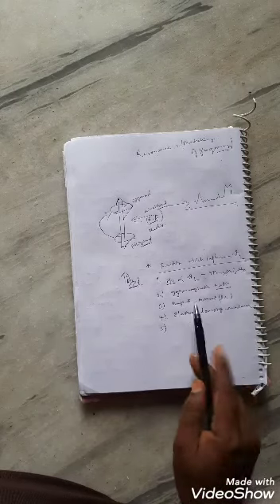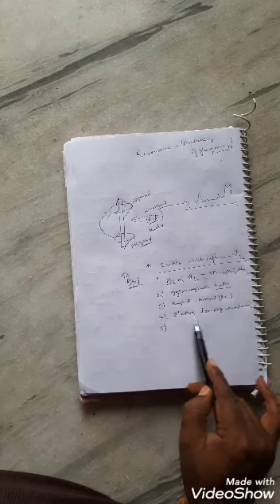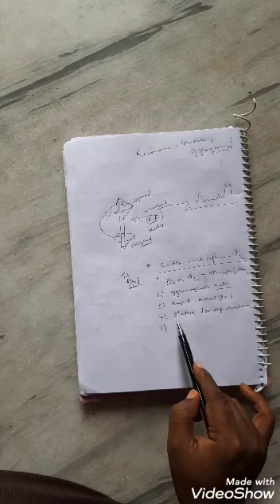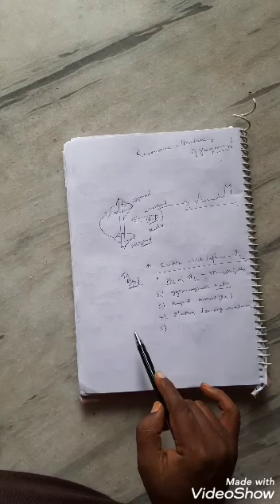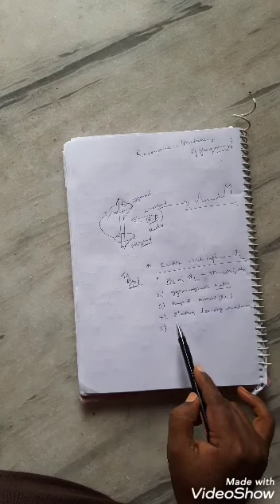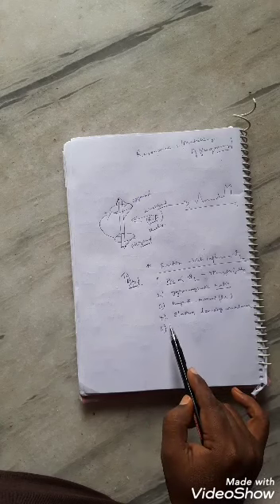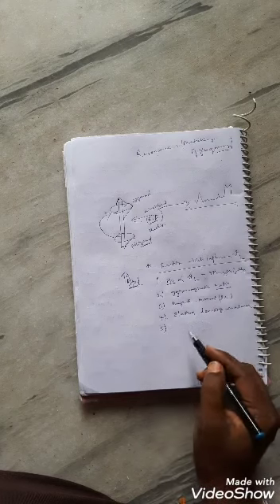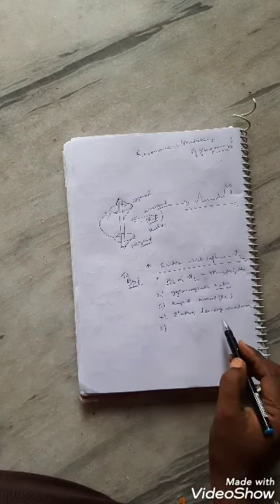Since these electrons are also charged, spinning bodies, according to the rule, any spinning charged body can generate its own magnetic field.